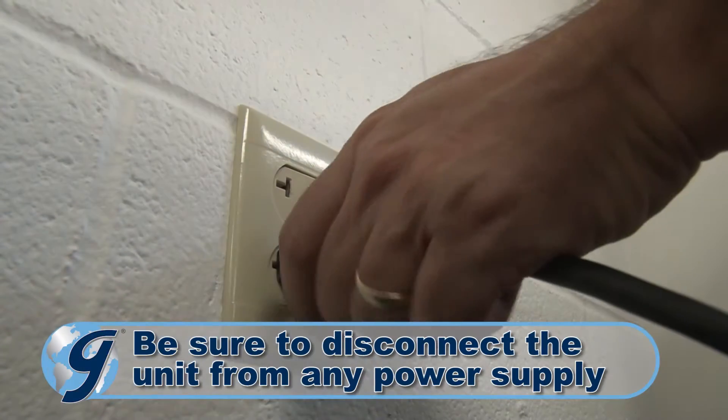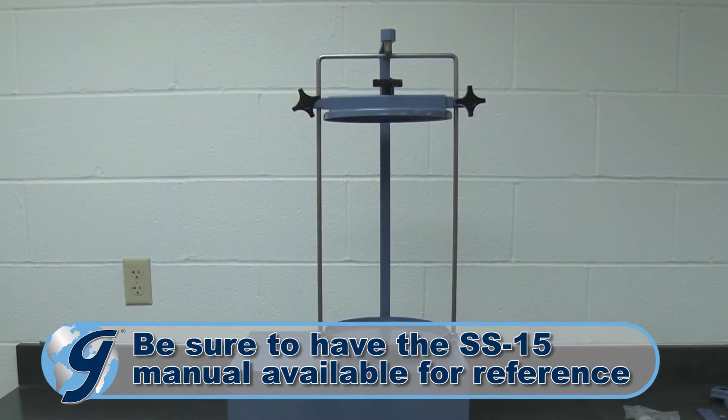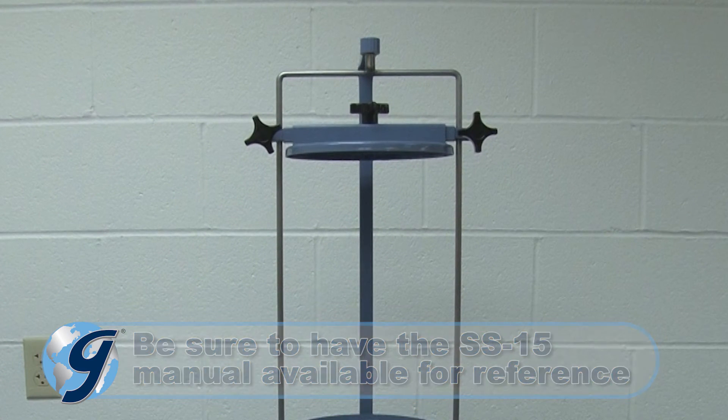First, unplug the unit from any power source. Now we're going to disassemble the older clamping system.